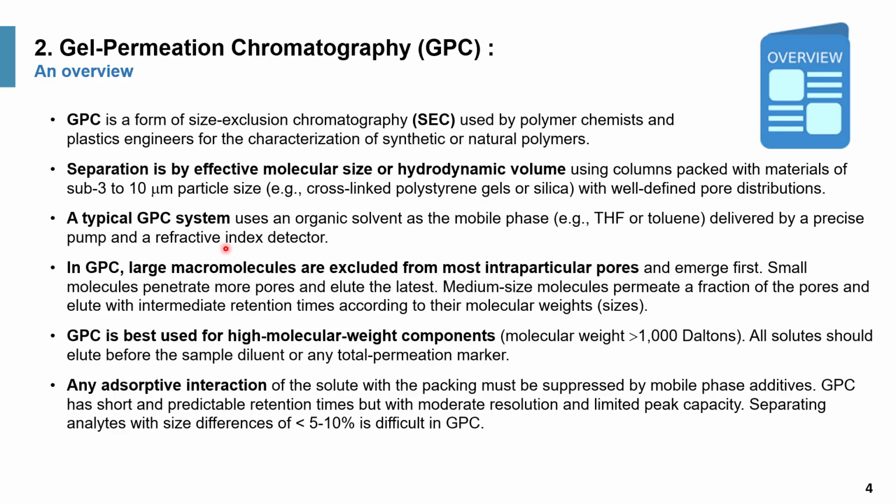Separation is by effective molecular size or hydrodynamic volume. So even though we like to equate them with molecular weight, the actual correlation is with the hydrodynamic volume or the effective size in solution.